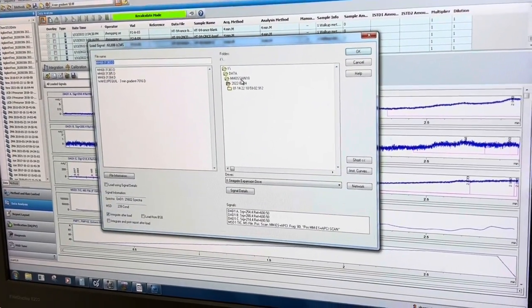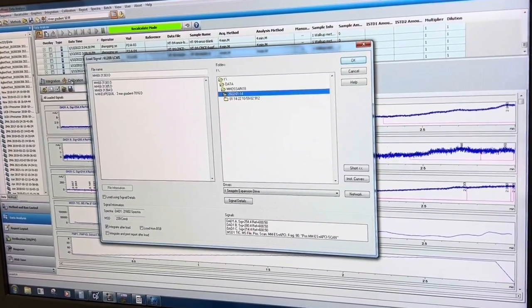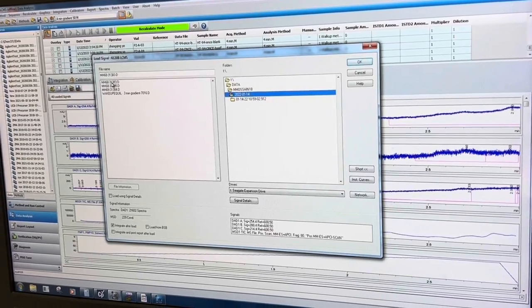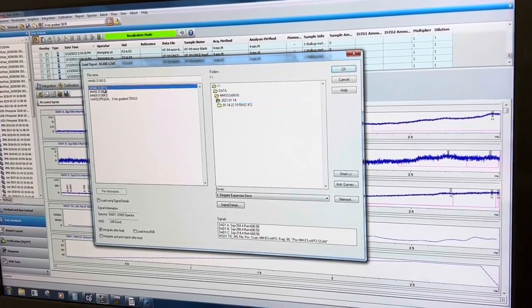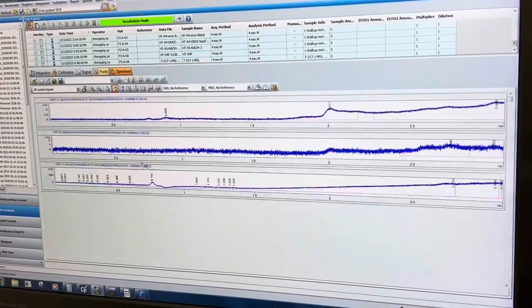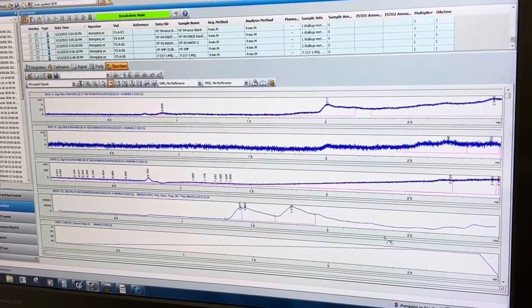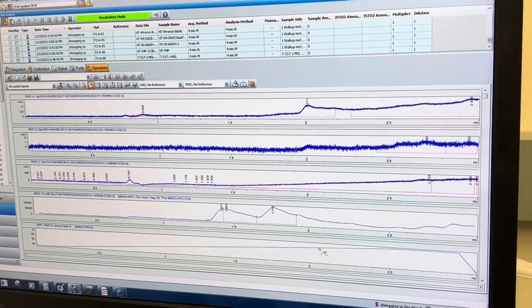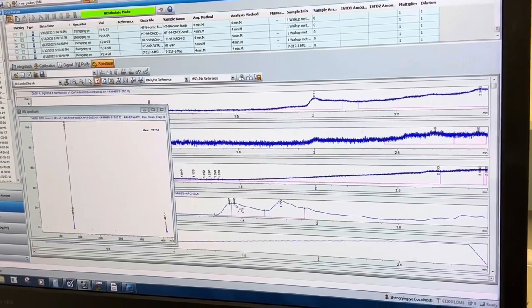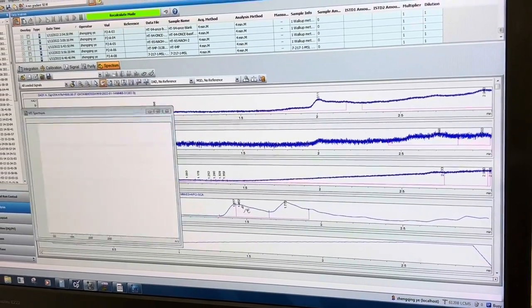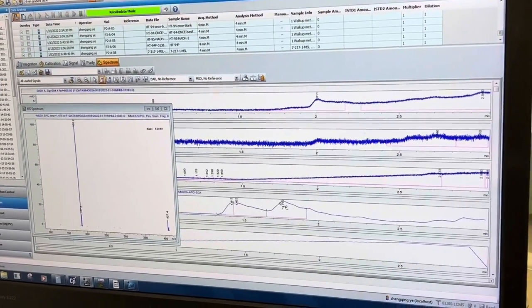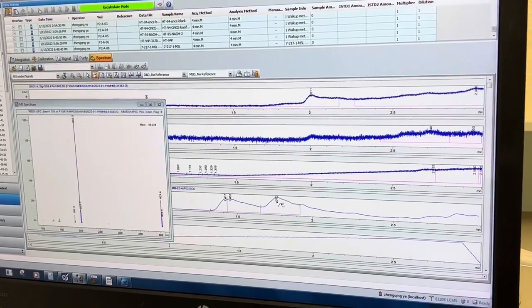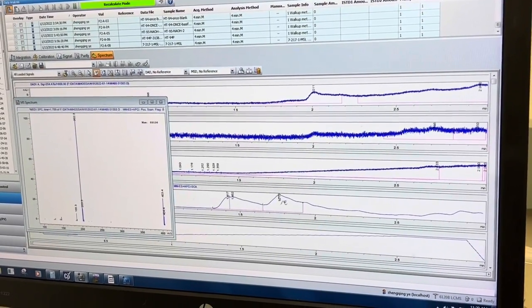And my part, my data, so here I opened it. So I can click all those peaks and to see like what is the mass I'm getting. 202.